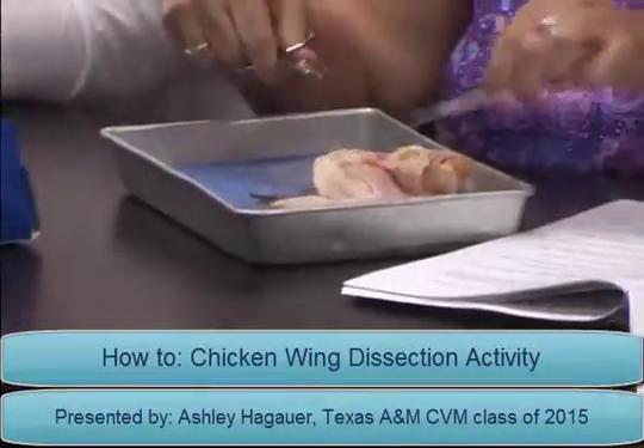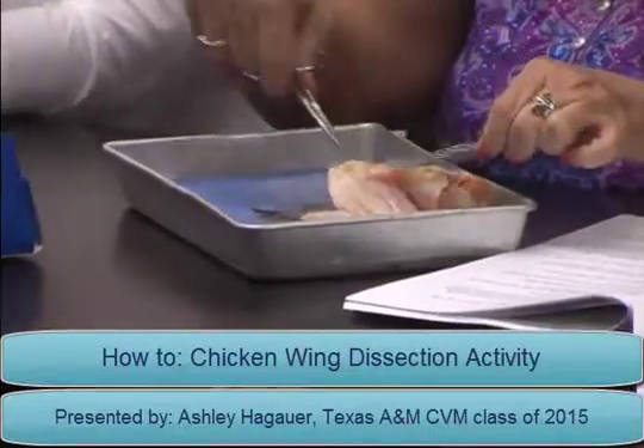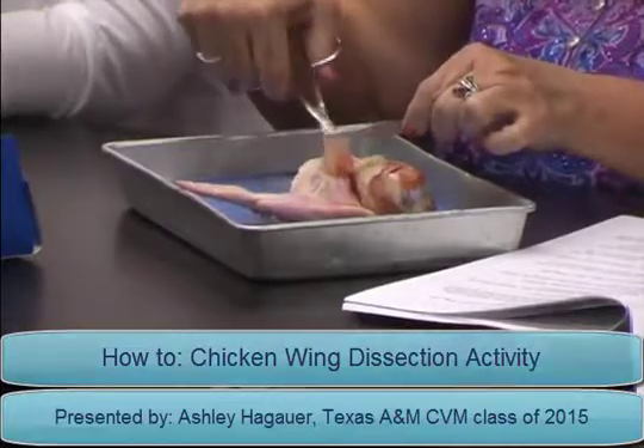In this activity, students explore the structure and function of bones in a chicken wing and compare them to the structure and function of the bones of humans. The students will investigate the bones, describe them, and make inferences about how they work.